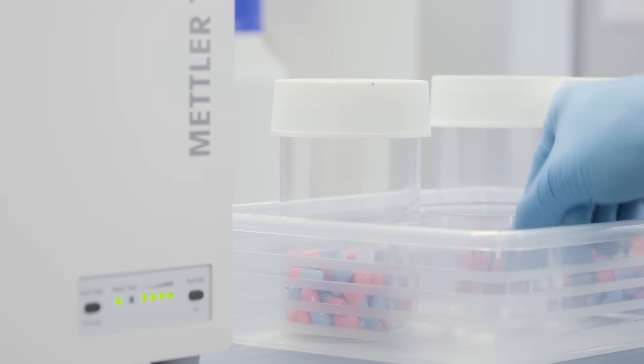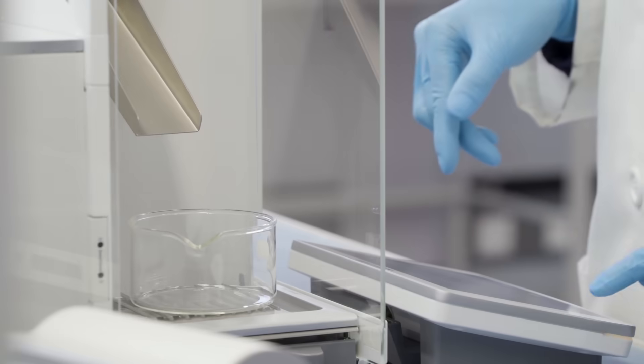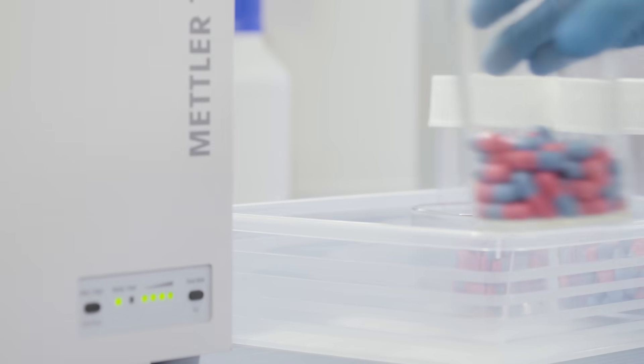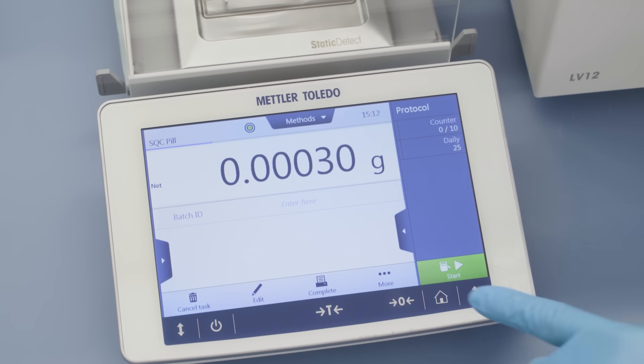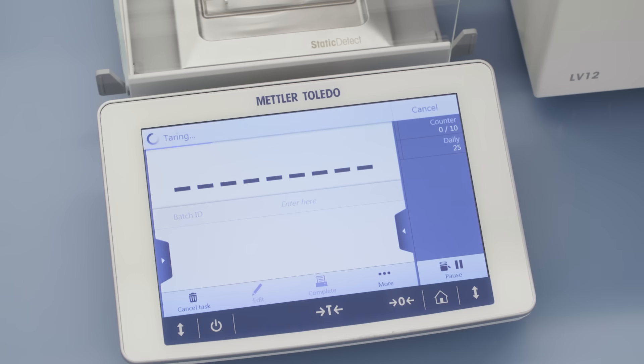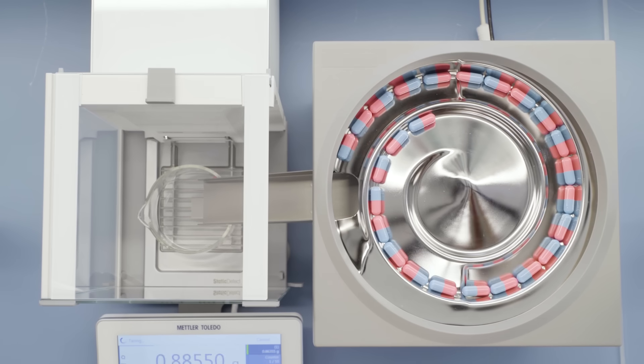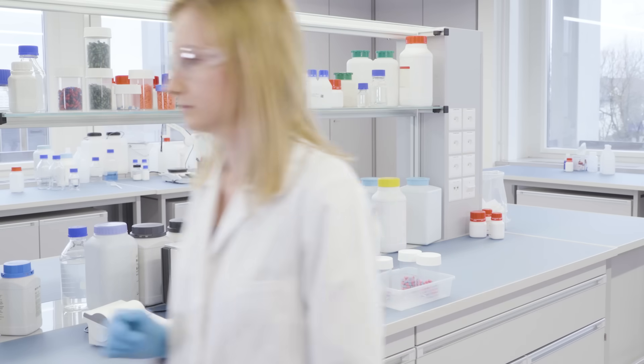To evaluate the uniformity of dosage units of a batch, a subset of specimens is weighed to determine the weight variation. The specimens are loaded into the feeder and the SQC application is launched on the balance terminal. The uniformity of dosage units test will run automatically.